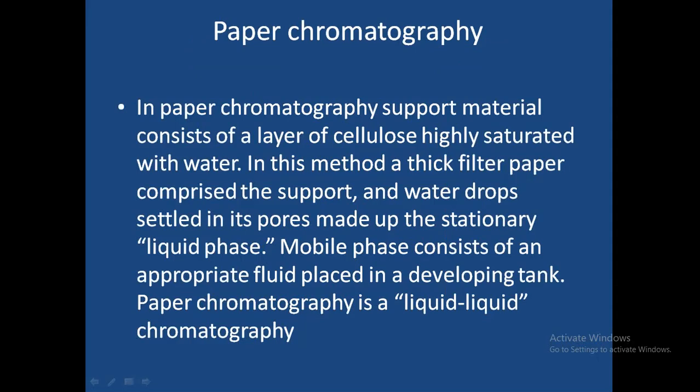And next comes paper chromatography. This is a very basic type of chromatography. Nowadays it's not being used, but before having a clear understanding of chromatographic techniques, it is better to perform paper chromatography in your own laboratory in order to understand the principle of the separation achieved using this chromatographic technique, as it is a basic technology.